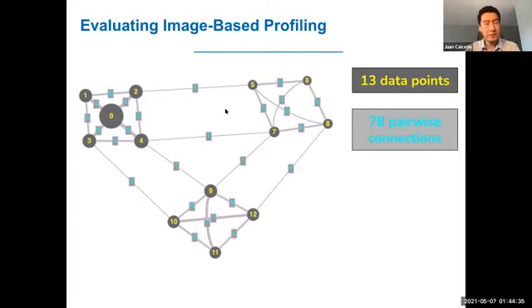If the feature representation that we get is useful, we should be observing clusters of compounds that share similar biological effects. That's pretty much the goal here. In practice, when pharma companies are actually running this technology, they don't know if the connection is real or not. So they have to follow up with another experiment, maybe more complex, not just images, maybe sequencing or something else, or maybe with real patients as well. But the goal of using images is to reduce the search space to a few compounds that are useful.